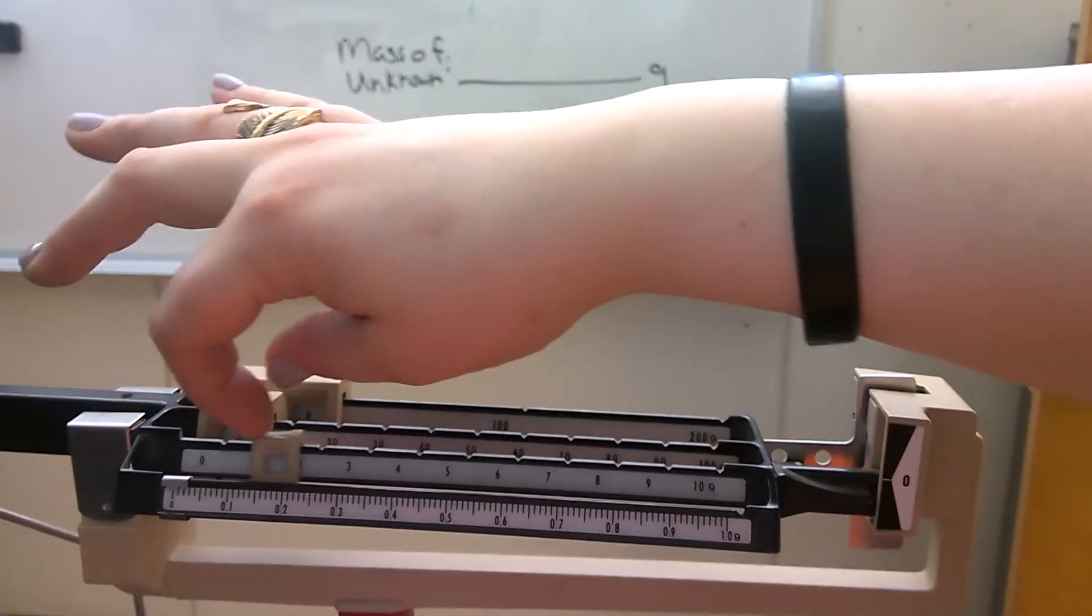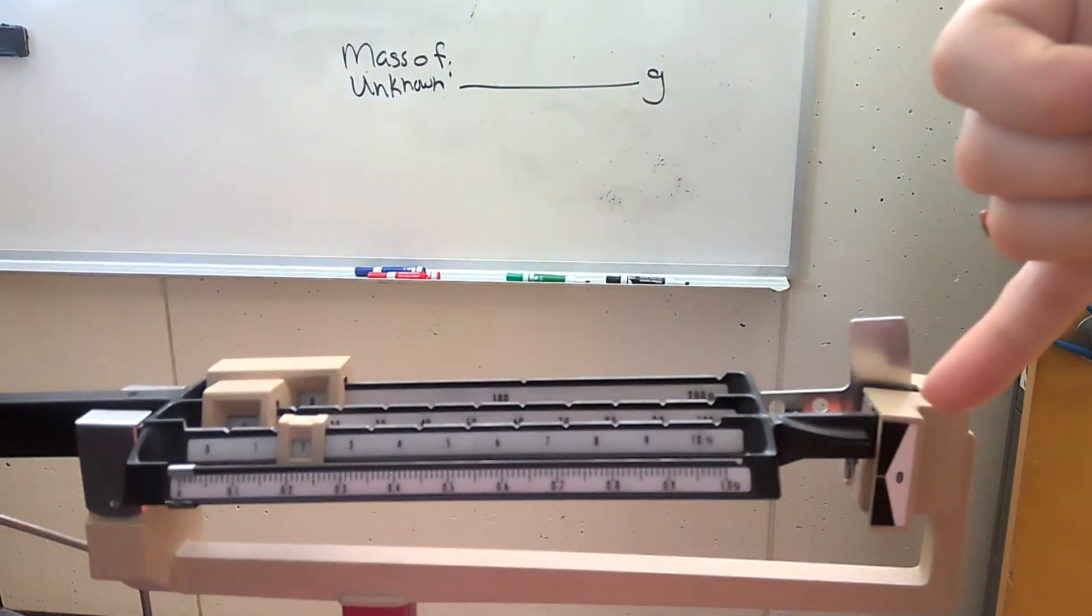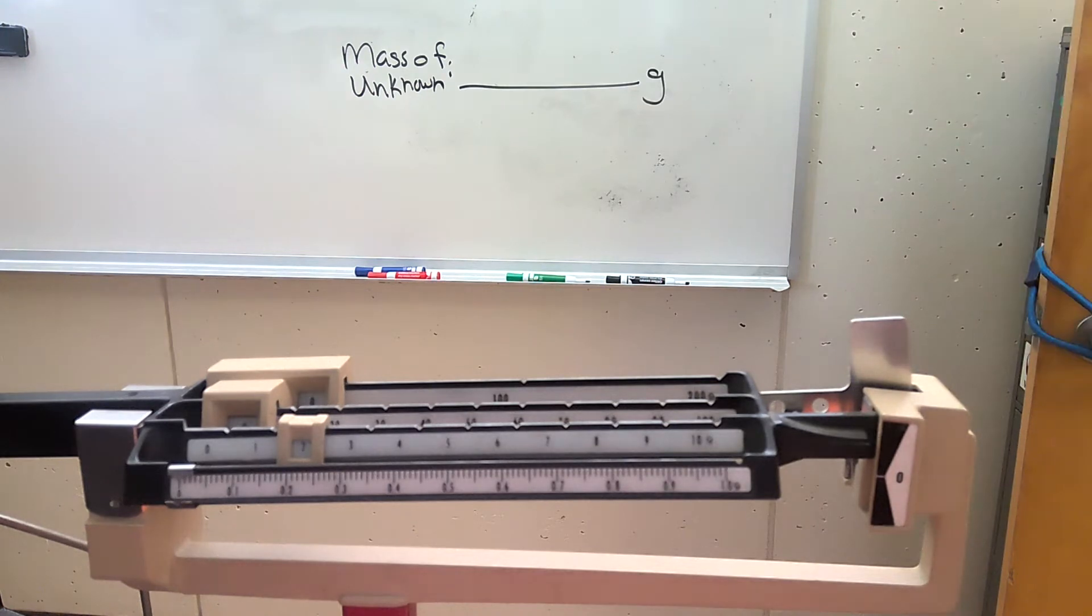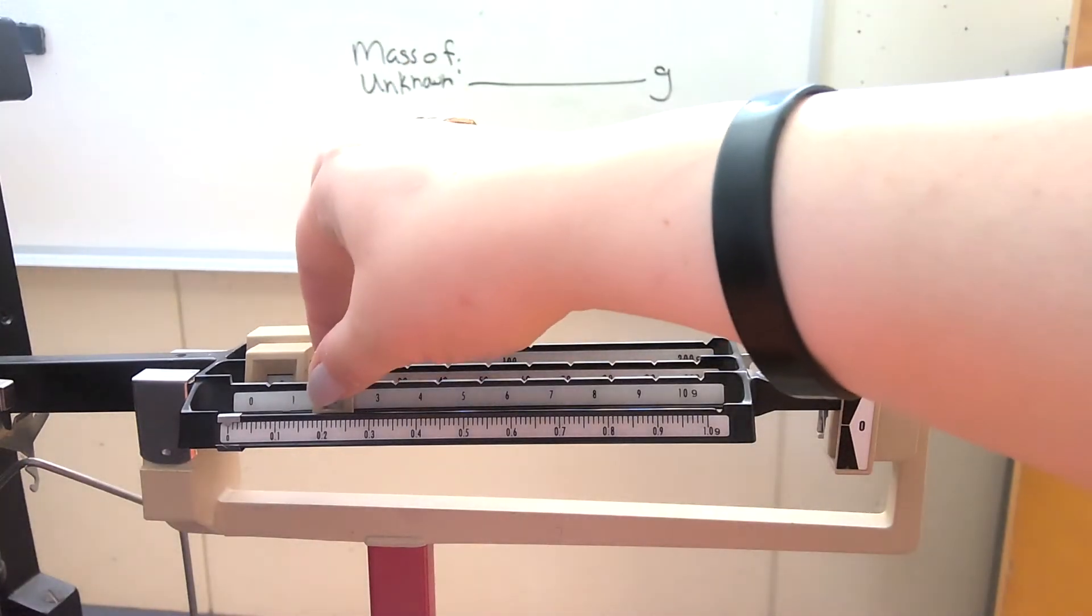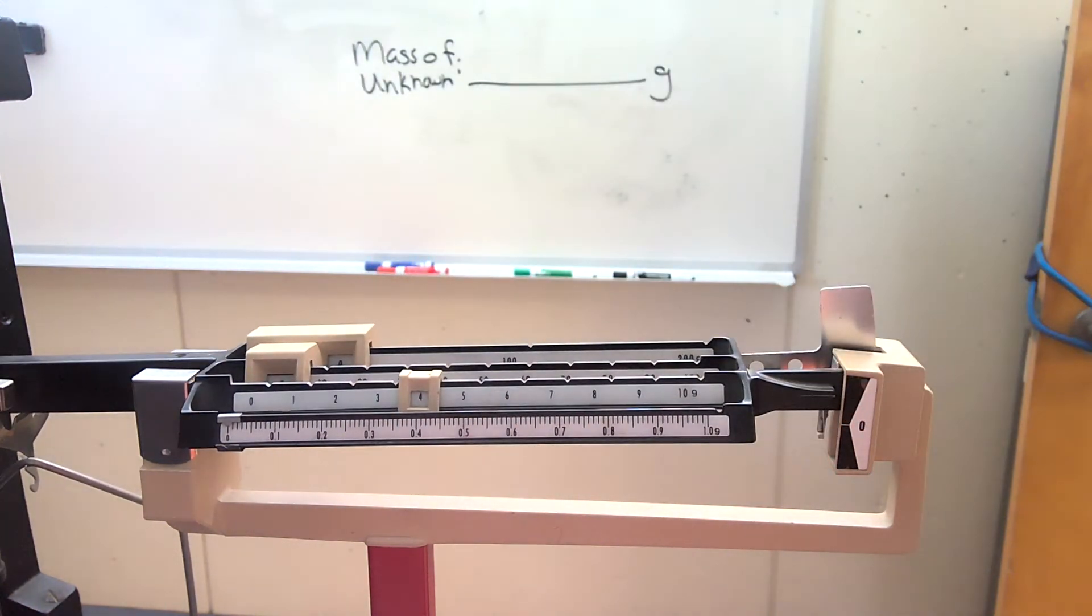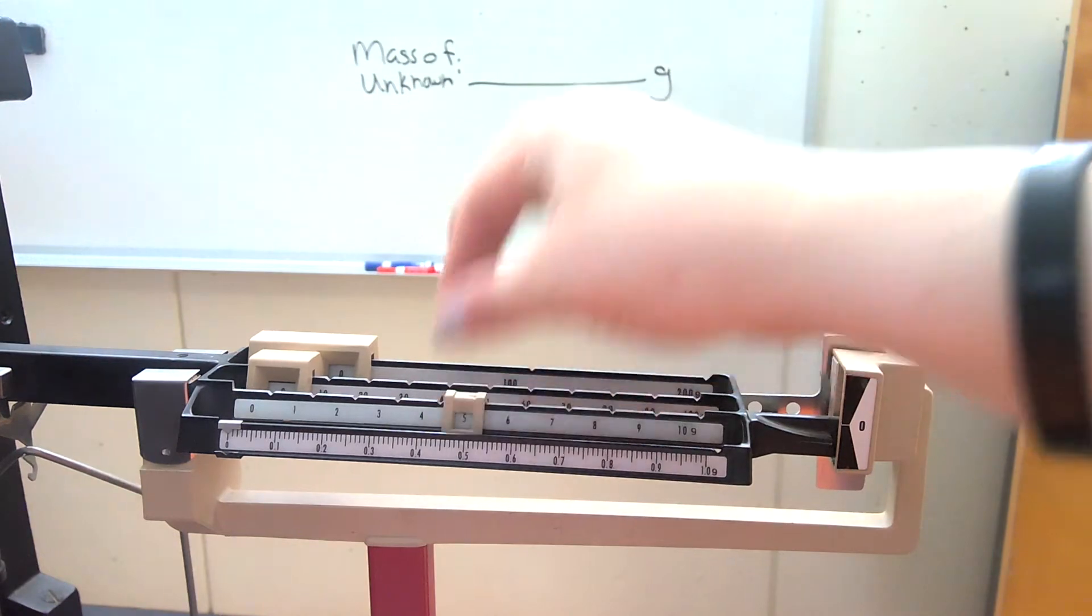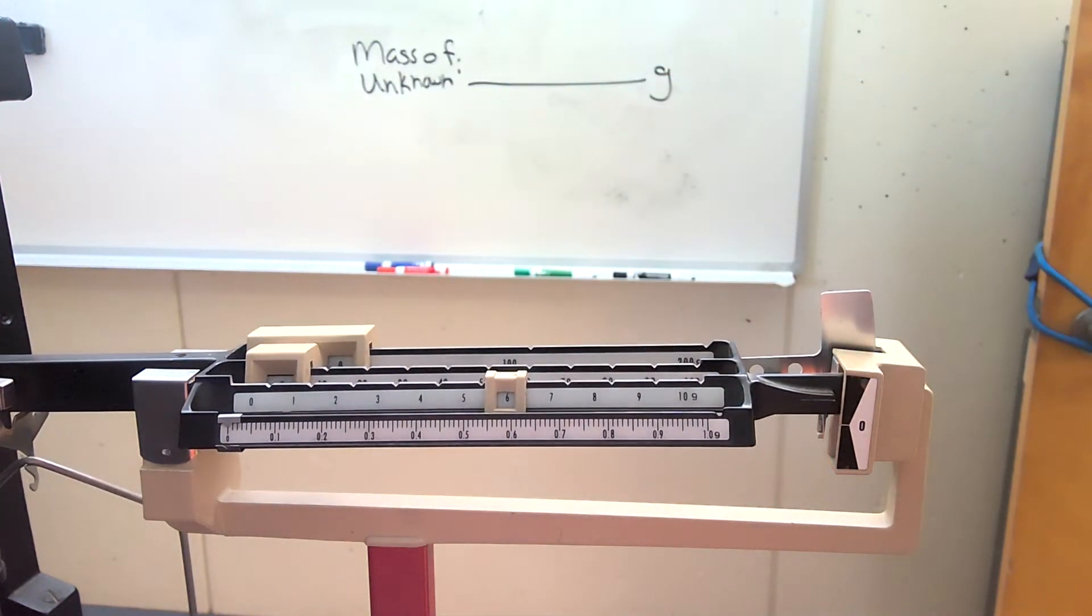Then we're going to move the rider down to two. Let's try two. It's above the zero, which means it's still not heavy enough, so let's move it by two more. Not quite there yet. Let's try five. So now when we get to six, we can tell we saw that the arrow was going up a little bit slower, which means it's really close to that zero.